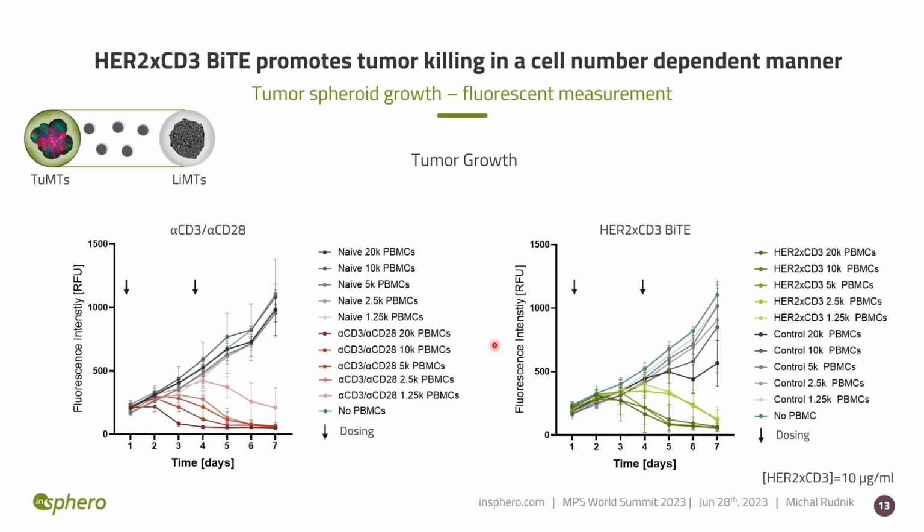Firstly, we assessed tumor killing efficacy with different PBMC numbers applied in the system, and we observed cell-dependent tumor killing in both CD3, CD28 stimulated PBMCs, here in orange, and HER2-specific antibody, here in green, but we did not observe any killing in naive PBMCs or control BiTE groups.